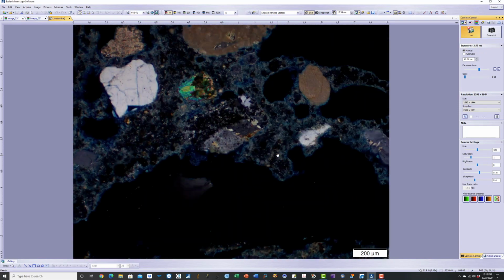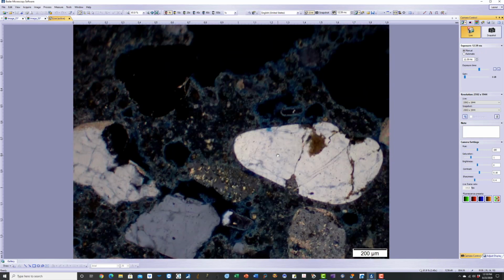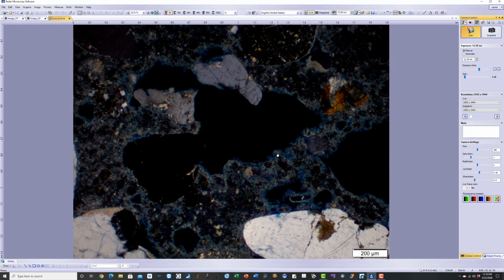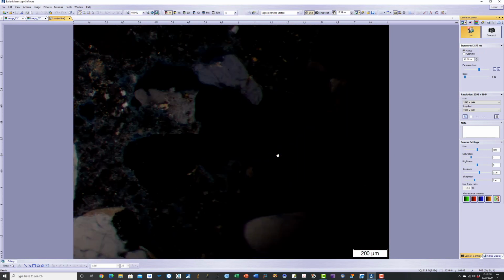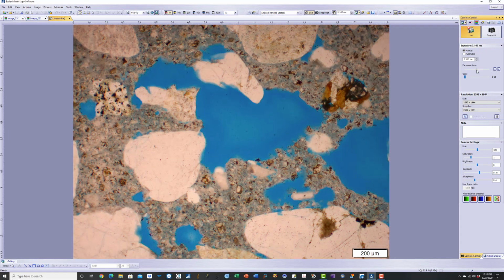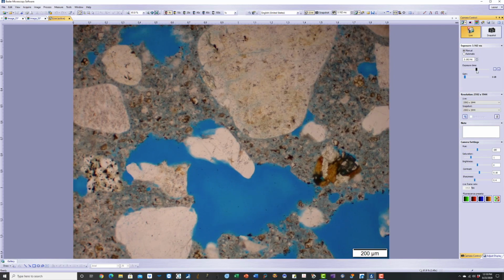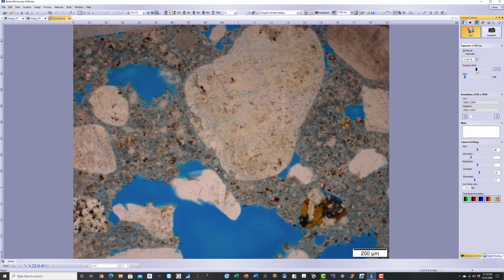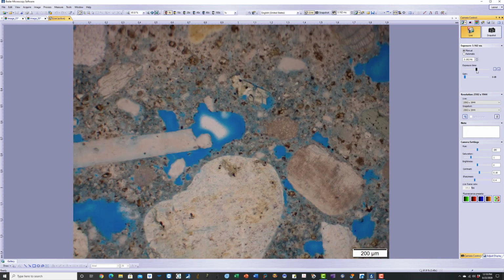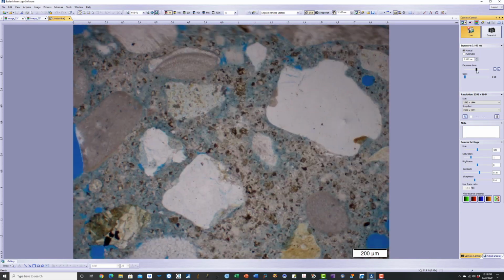Now this protective coating is still carbonated and porous. It's not as dense as it should have been for adequate protection. You can see how porous the protective mortar coating is for most of the portion. The water cement ratio here is estimated to be 0.45 to 0.50 in the mortar coating paste, and the majority of the mortar coating is about 20 millimeter in thickness.